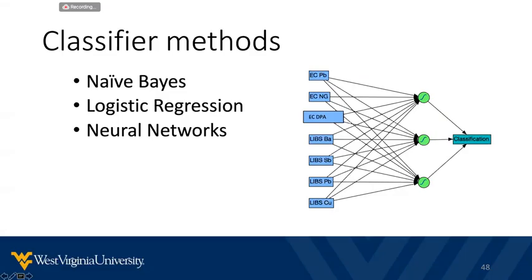In these confusion matrices, we can determine how many times a shooter sample was confused with a background sample and vice versa. And these were used to calculate the performance rates. The figure at right represents a simple neural network consisting of 7 input variables and 3 nodes with 1 hidden layer. An advantage of classifier methods is the capability to learn patterns derived from large populations and provide probabilistic outputs that can be later used to support the interpretation of the evidence.